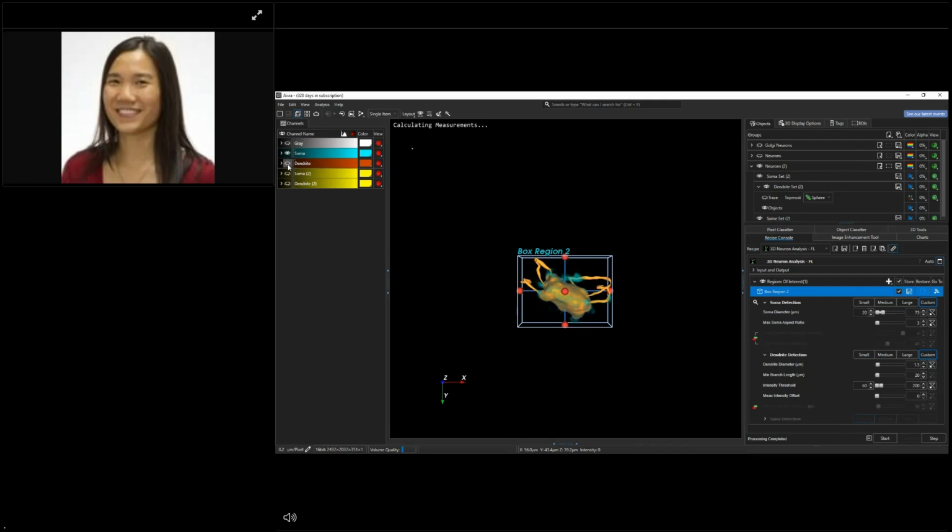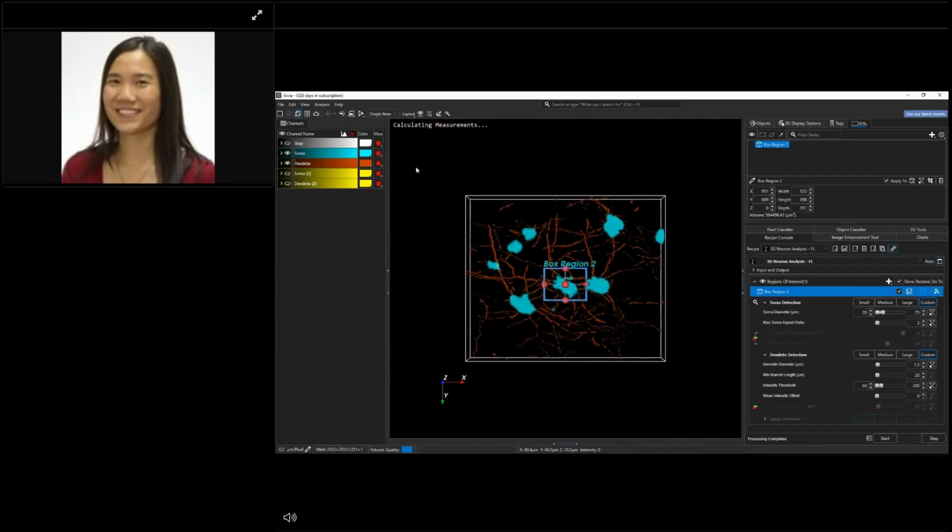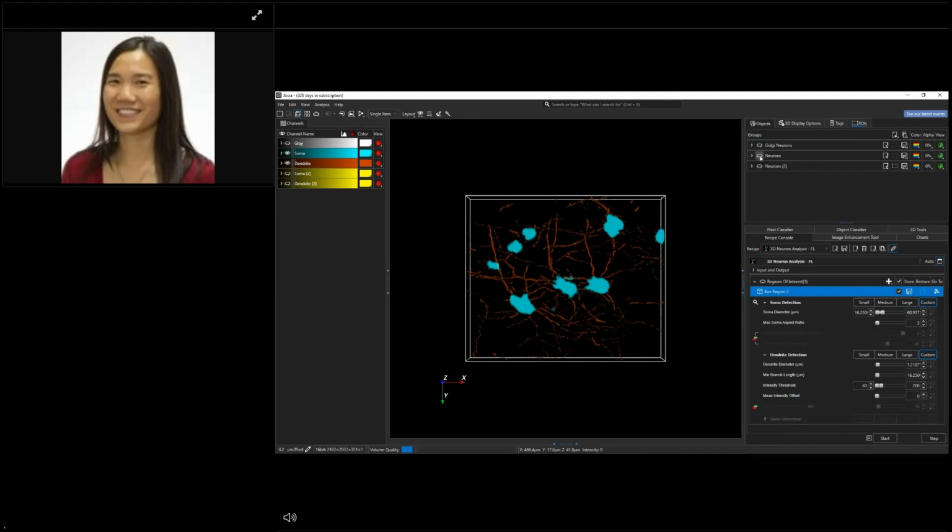I'm going to go ahead though and do my thing of providing you with previous results that I've done, and this time for the full image. Let's remove this clipping here. Zoom out a little bit so that you see it a little bit better. And then finally, let's turn on those results that I have already done. This looks pretty good, and we can see that there are multiple somas with dendrites connected here.